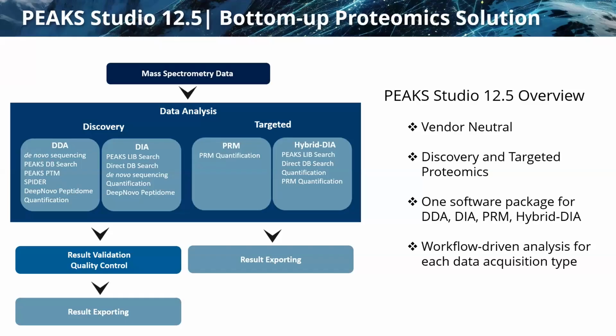So this is our Peaks Studio 12.5. We are a vendor-neutral software, so of course that means regardless of what mass spec vendor you use, you're able to load in the raw data into Peaks and analyze it without having to convert it prior to uploading it into Peaks.